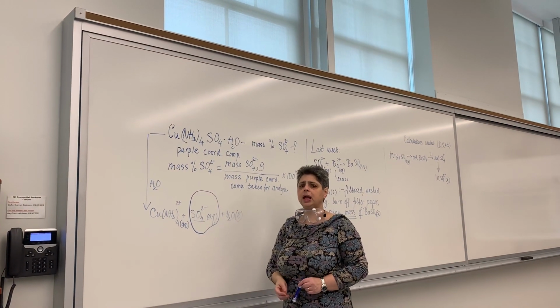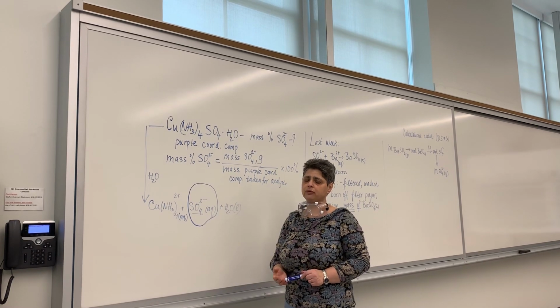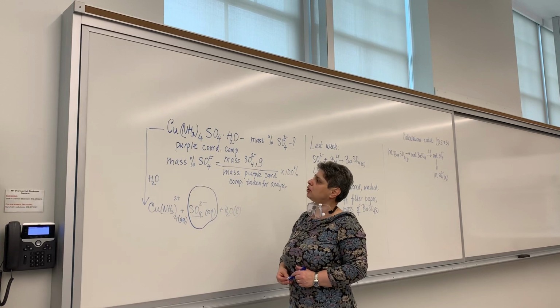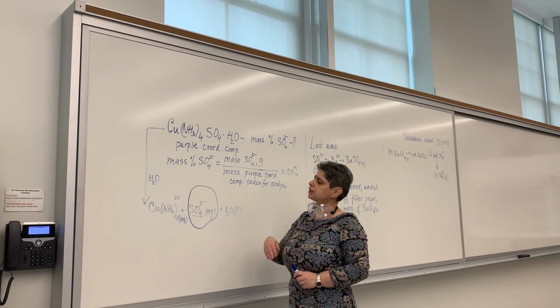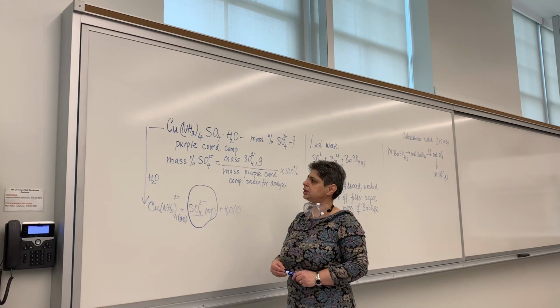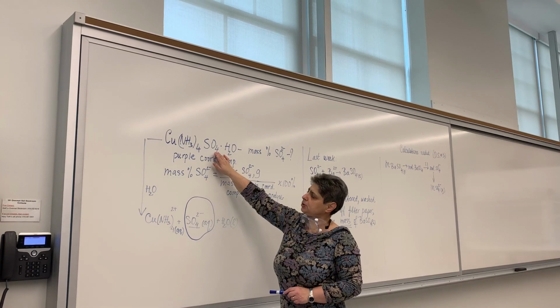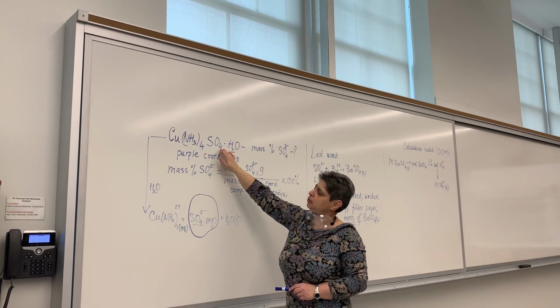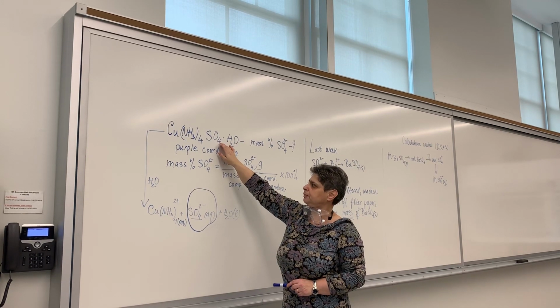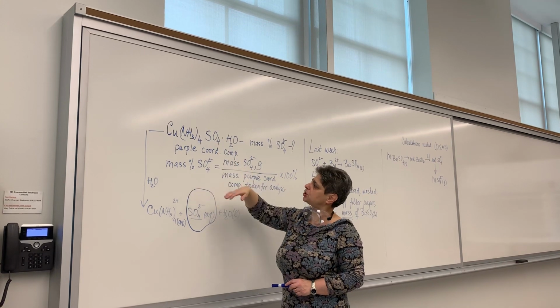Because you're not able to be here and you're unable to complete the procedure on your own, I've been showing you what you would have been doing if you were in lab. So this week what you would do is continue working on gravimetric analysis. In the previous video we took a portion of the substance and weighed close to 1.5 grams, and you will be given the exact mass. Shortly the file will be emailed to you with all the information.